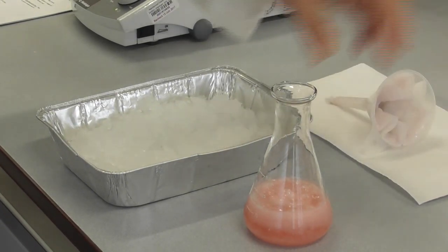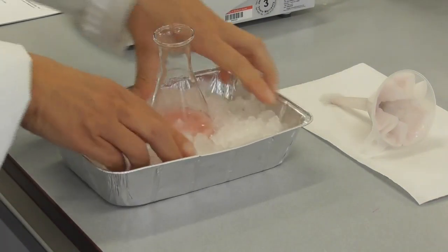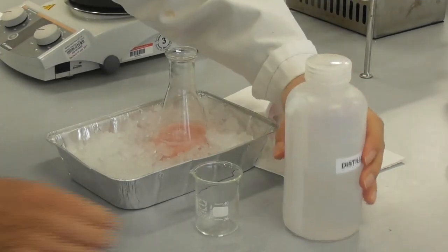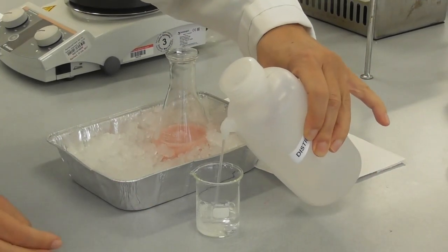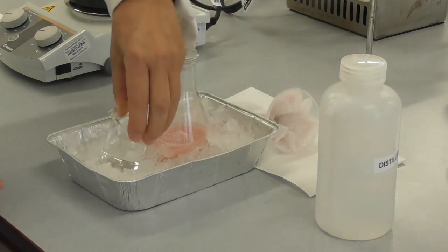Once the filtration is done we remove the filter and put the flask into an ice bath to encourage more crystallization. We add some distilled water into a small beaker and put this into the ice bath as well for cooling off.